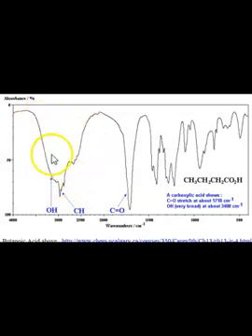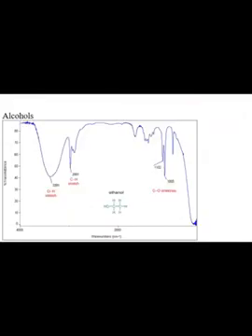But you see that's carboxylic acid. There's another characteristic carbonyl group, and this time it's just over 1700. There's some other things in here, but this author did not really point them out like the last spectrum.